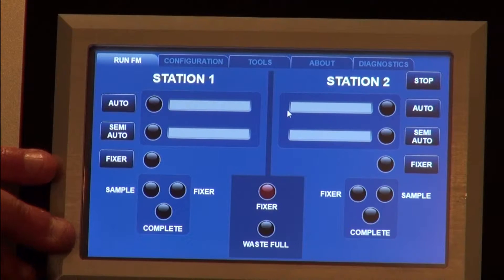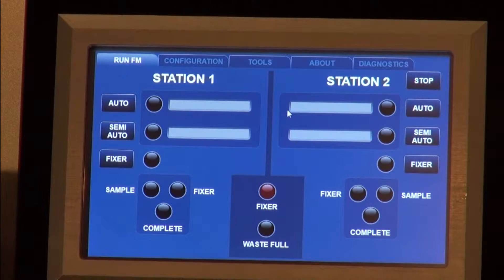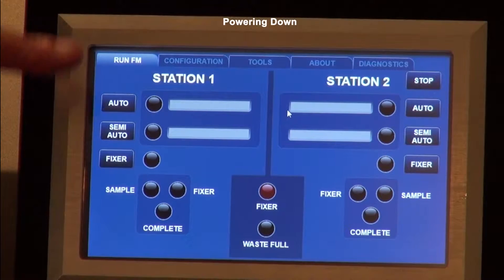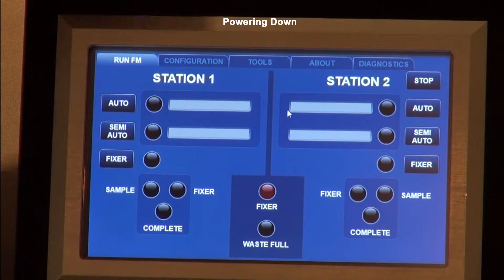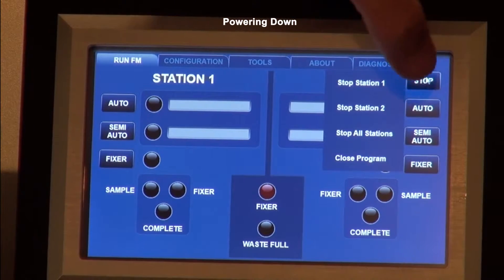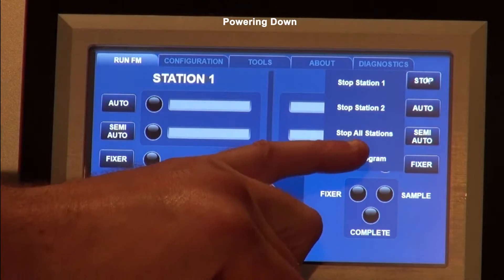Now that the unit is booted up and the program has come up, I'm going to show you how to shut the unit down. It all boots up in the Run FM menu, and if you go to the upper right-hand corner there's a stop button. You can select the stop button and then you've got to press close program.